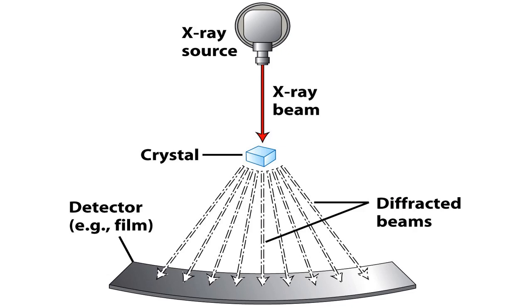The crystal can be rotated or mounted in different orientations so that we can get two-dimensional images, and when we get the two-dimensional images from different sides, we will combine them and we will get the three-dimensional pattern of the crystal.